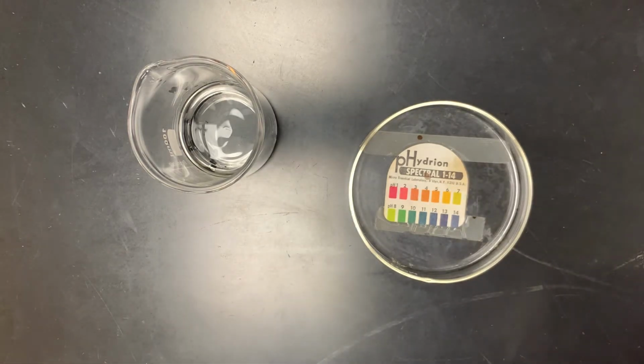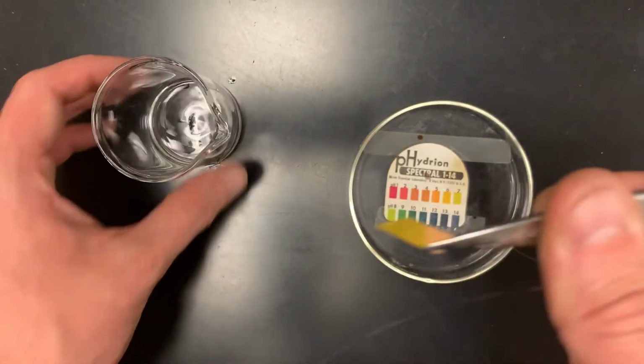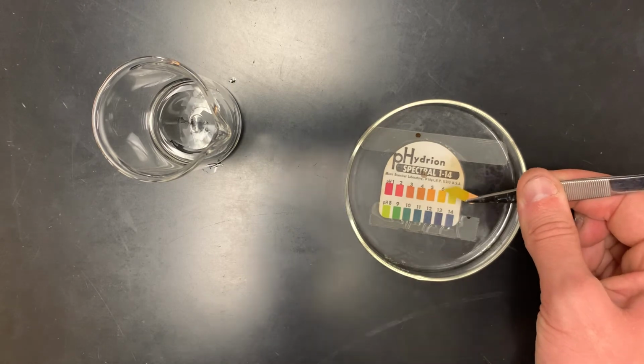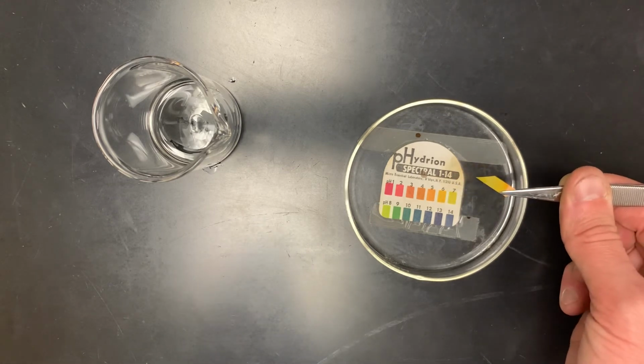We'll push on and get to our sodium acetate. Okay. Looks to be about a pH 7, which again would suggest neutrality, right? But you've got to keep in mind that our water in the first place was slightly acidic.